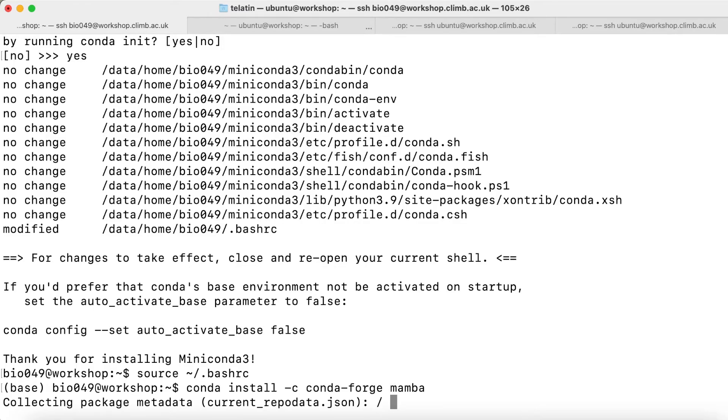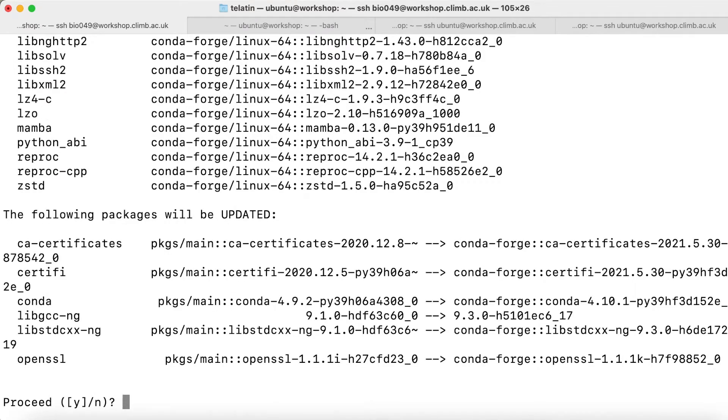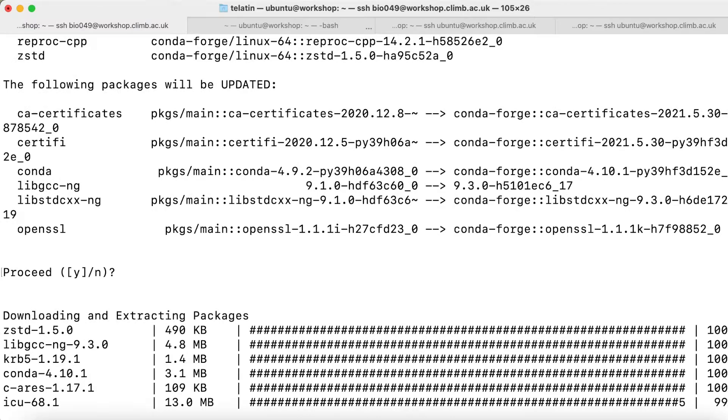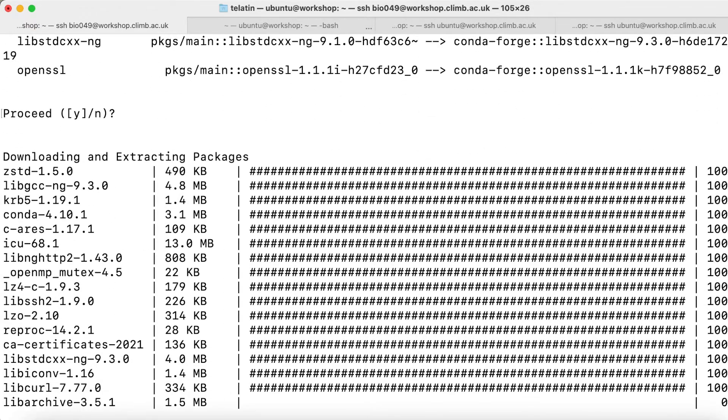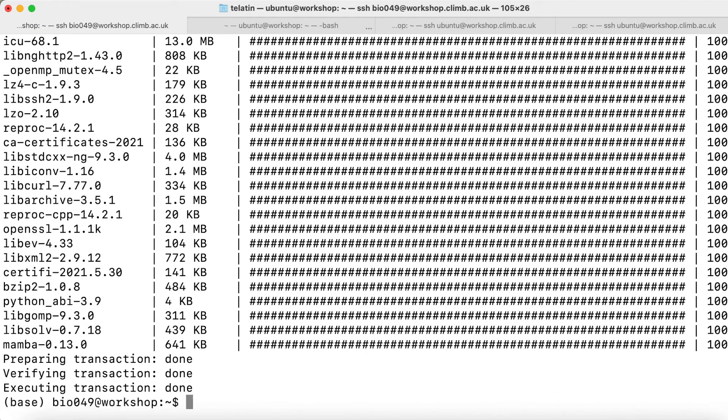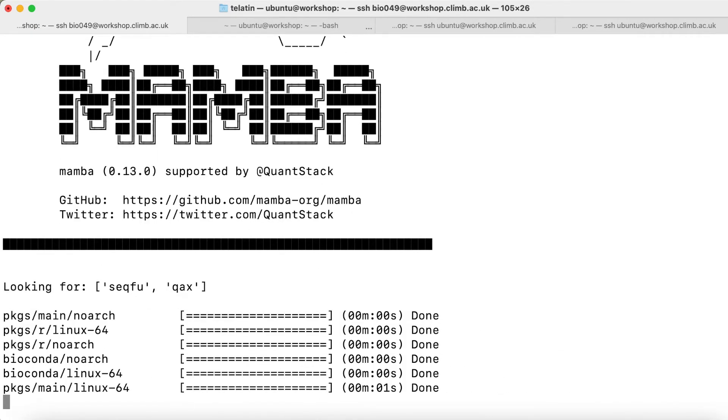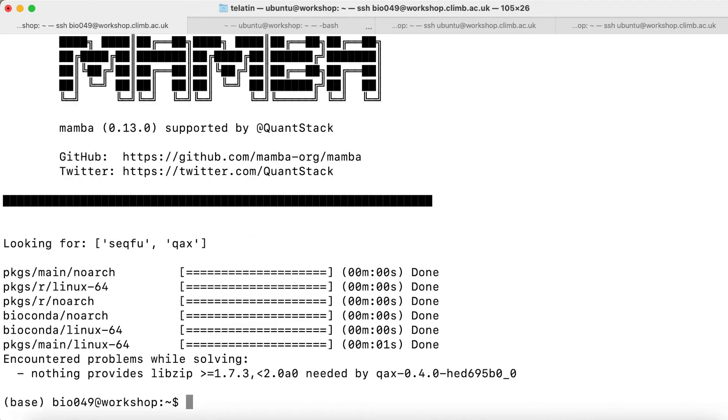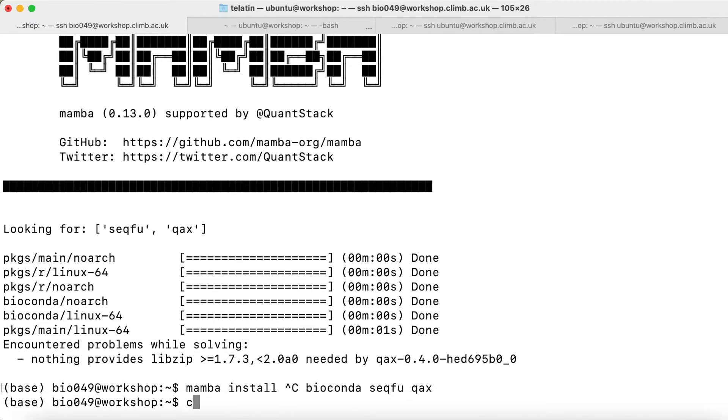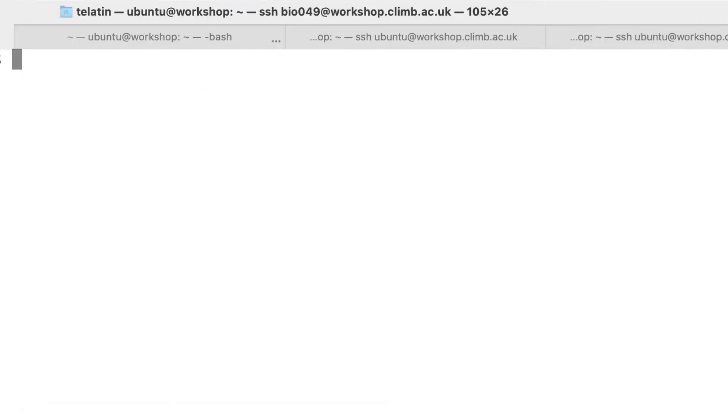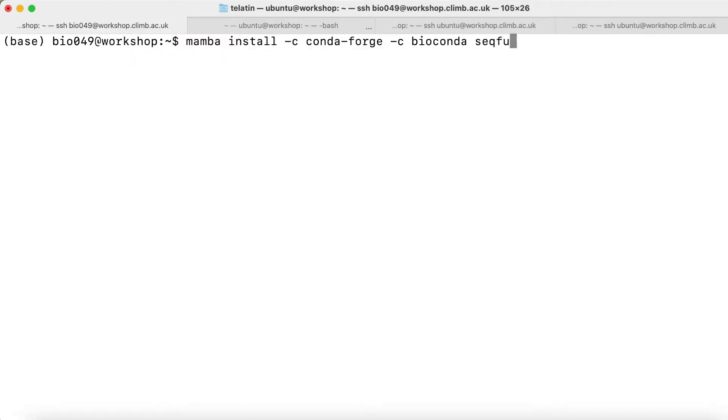If we add minus Y in the command, this will force the installation. We have this prompt, so hit enter to confirm that we are happy. Now we can use Mamba to install a couple of packages like seqfu and qax.